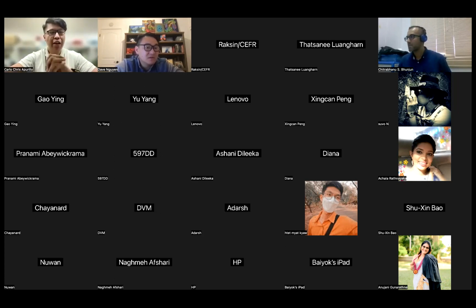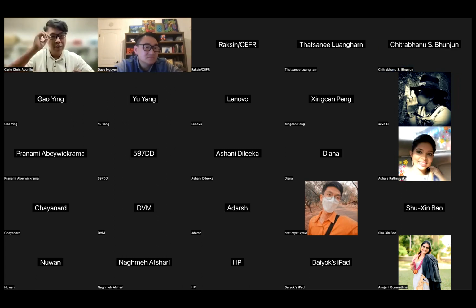Hi, Dr. Dave. I'm actually very interested in the talk. If Dr. Avi was looking at it from a very macro perspective, I want to bring it down to a more micro perspective also, because I could see the potential of using the software in differentiating specific species, because sometimes we're looking at spores which look almost the same to the human eye, but can actually have differences, and I am seeing the potential of using the software there.